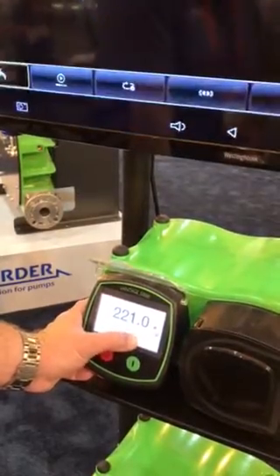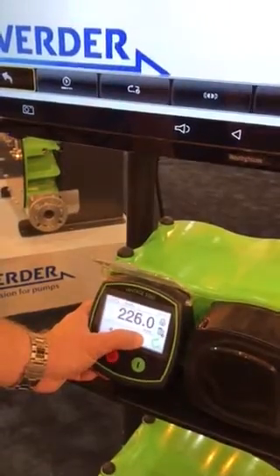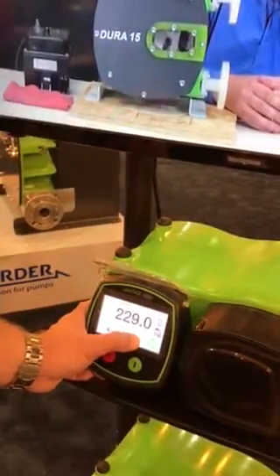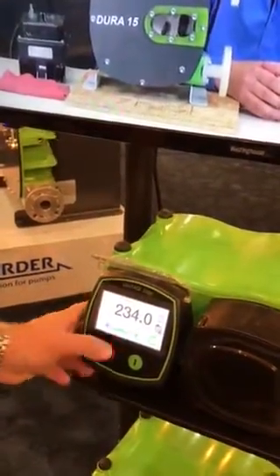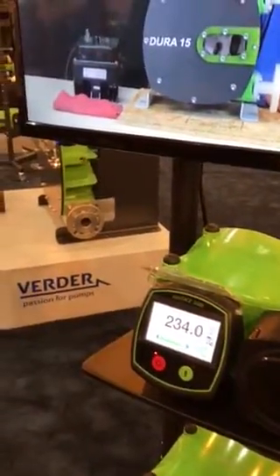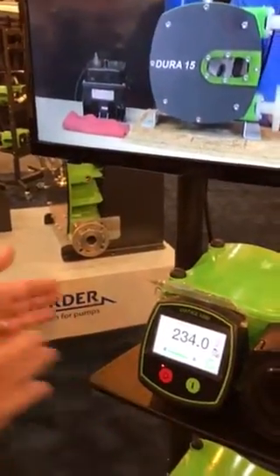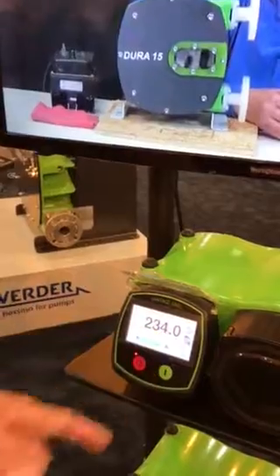So here we're now increasing. Now we're increasing by one, two, three, four milliliters per minute. And what this does is it's actually intuitive. So once you start increasing to 234 milliliters per minute, you don't necessarily need to control the tenths or the hundredths position — it moves you on up to the single digit position.